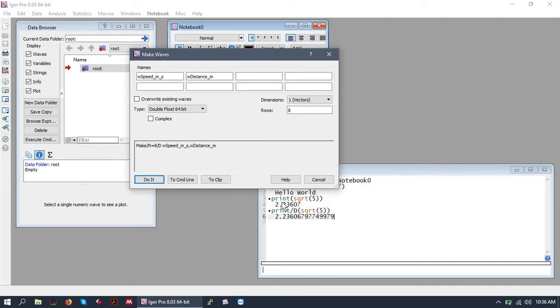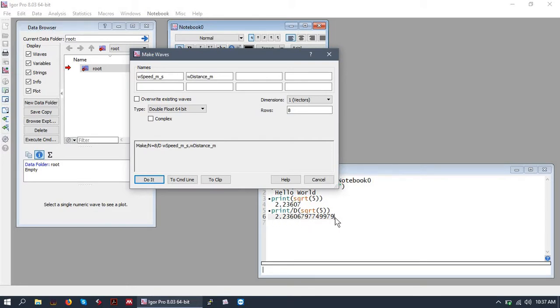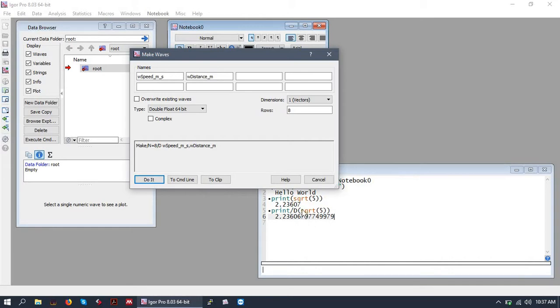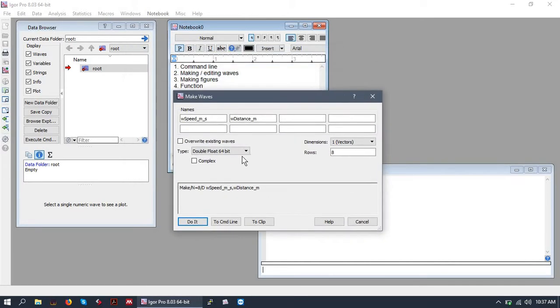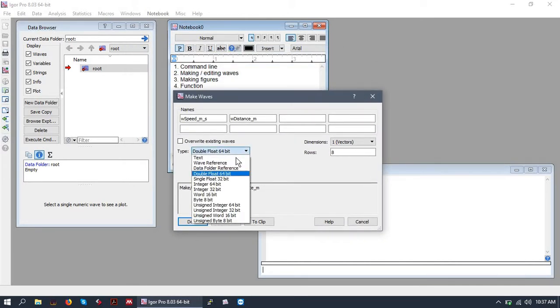So call back to before when we print out the square root of five. When we gave the flag D, it printed out the double precision variant of the square root of five. So that sort of gives you a sense of the difference between a single and double float wave is the precision of the numbers.